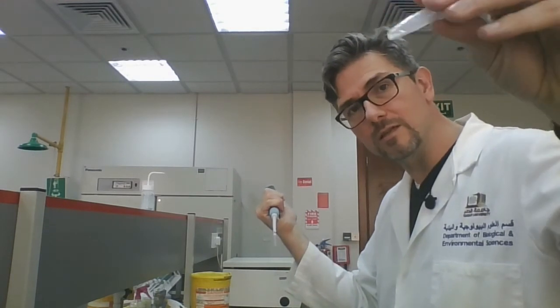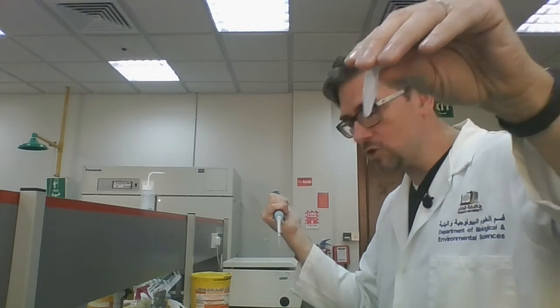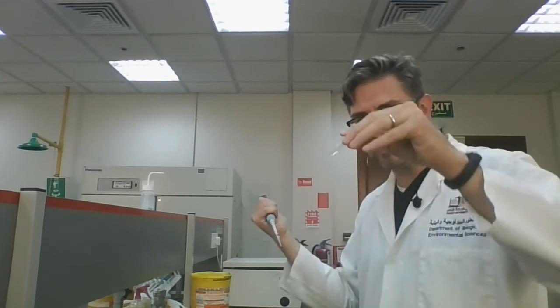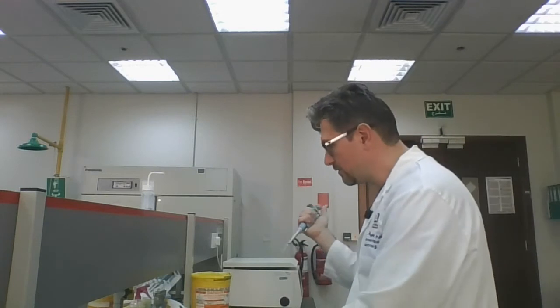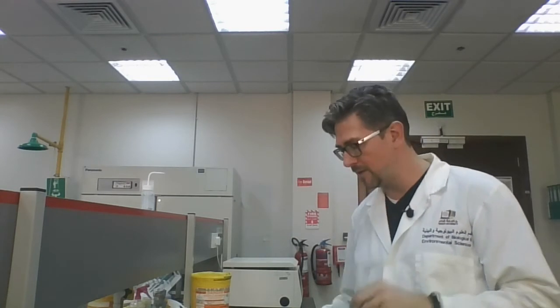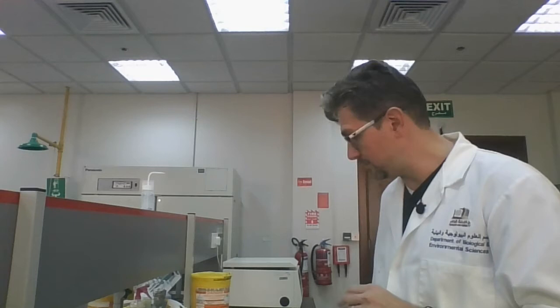Now, I don't want to be too rough with my mixing right now, so I'm just inverting a few times gently, because what we're doing is we are denaturing that genomic DNA. If we are too rough with this, if we were to take this and mix it with a vortex, we would probably break apart that genomic DNA into tiny little fragments, and then it will be impossible to separate our genomic DNA fragments from the plasmids. So we want to keep that genomic DNA intact. So now that we have this, we're going to place both of these tubes on ice for about 5 minutes. And while we're doing this, we're going to prepare for the next step.